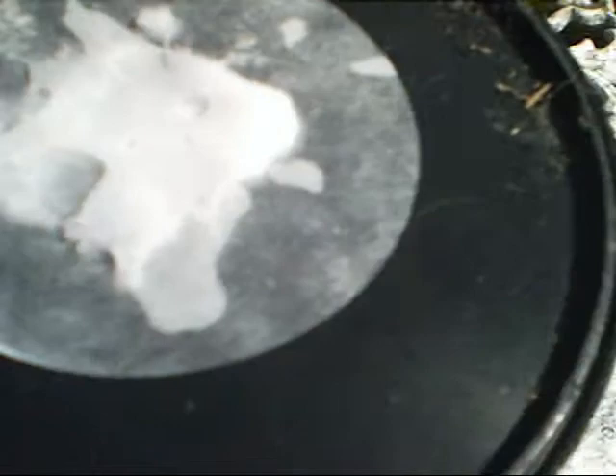Here's my raw boric acid that I've created. It has been vacuum filtered. Unfortunately I was not able to video that, as it required both hands and I don't have a tripod at the moment.